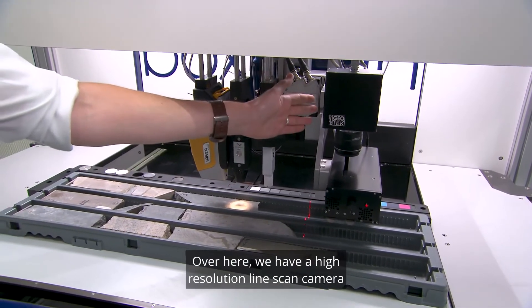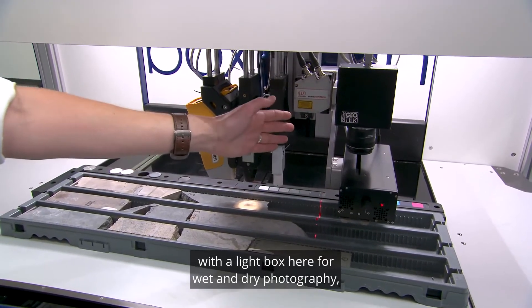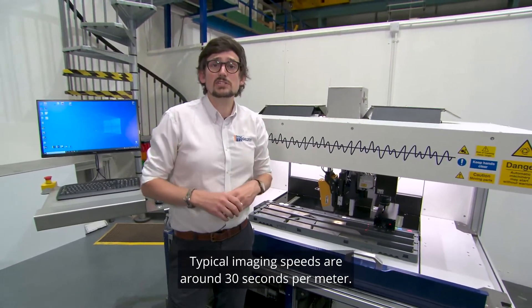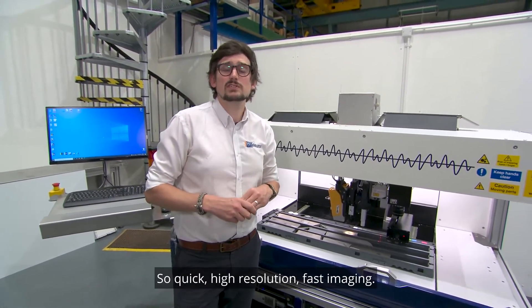Over here we have a high resolution line scan camera with a light box for wet and dry photography, collecting images at around 100 pixels per centimeter or even up to 400 pixels per centimeter. Typical imaging speeds are around 30 seconds per meter — quick, high resolution, fast imaging.